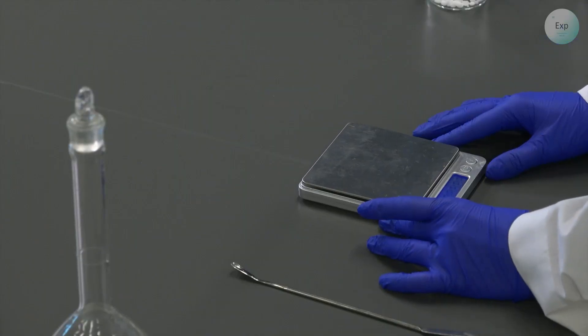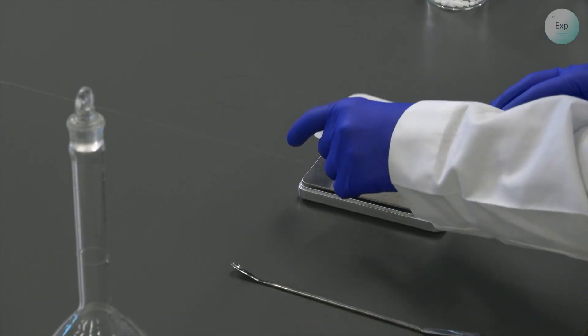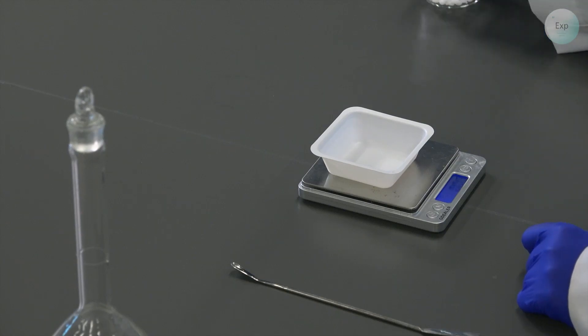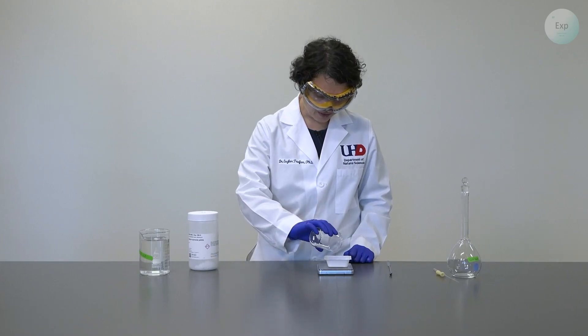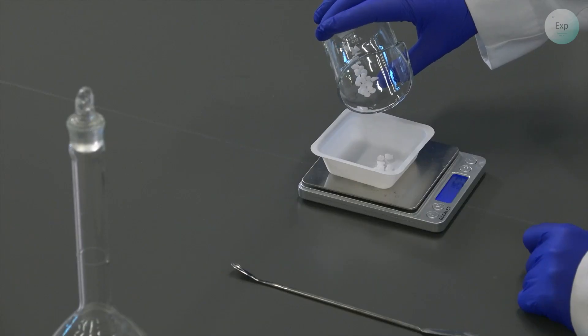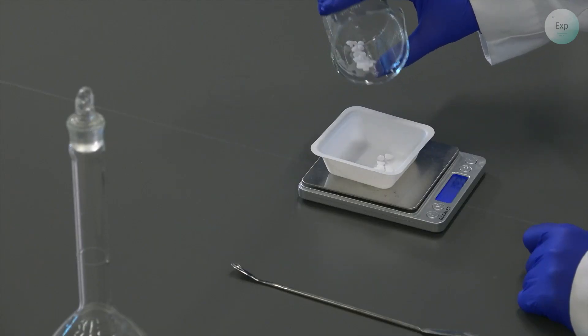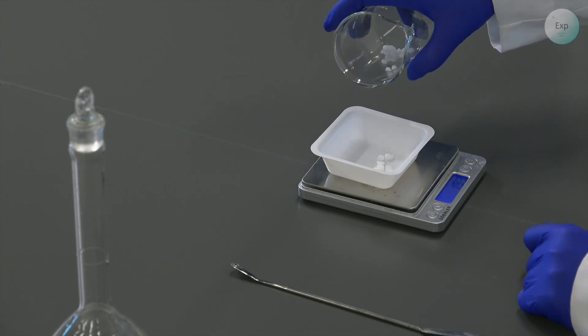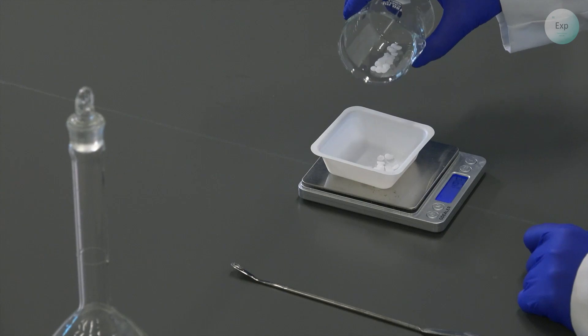Next, we turn on our scale, place our weighing boat on top, tare, and then transfer two grams of the sodium hydroxide pellets on it. We need to stop when we are relatively close to the two grams. So if it's a little under or a little over, that is acceptable, just not too much.